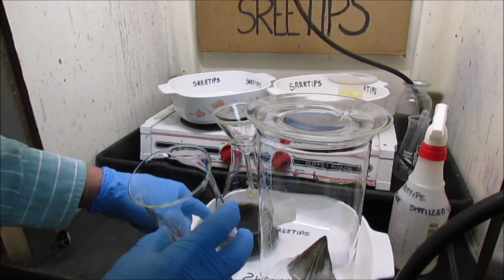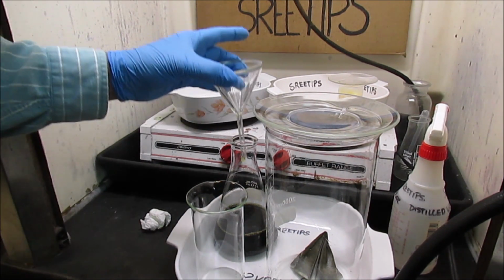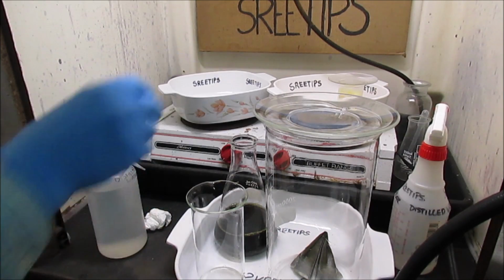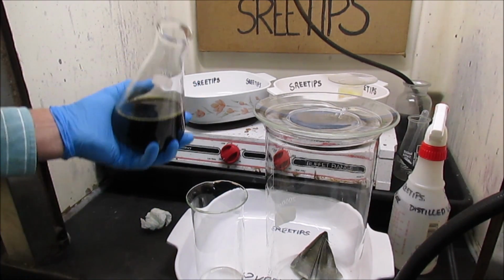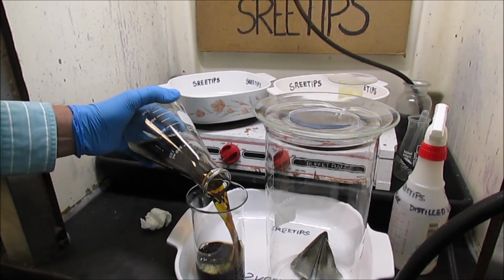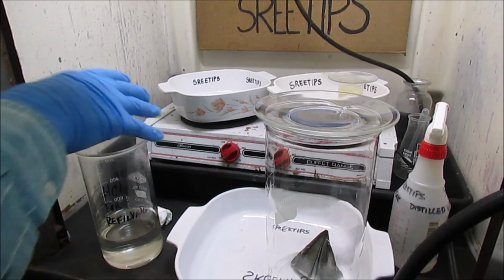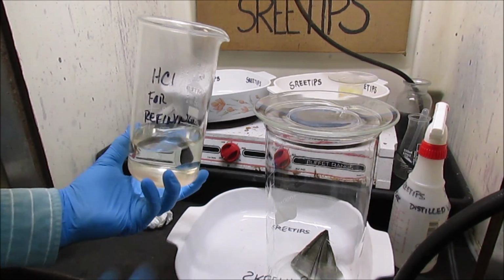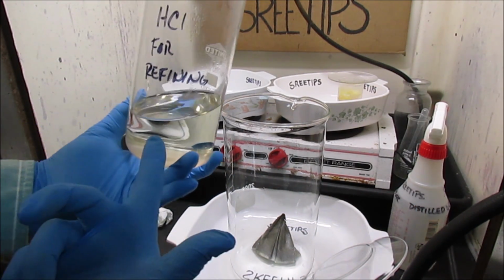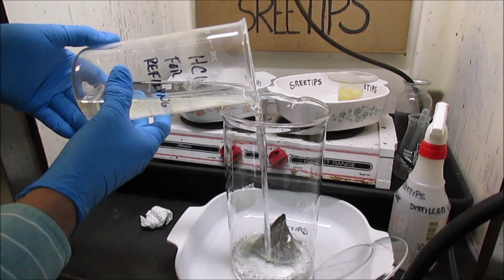For the solution here that came through the filter, I'm going to pour that into this tall beaker. I'd be tempted to add this to my main solution, and I might do that, but I won't do it until it settles out completely. Alright, I'll set this solution off to the side here. This is some hydrochloric acid that I had some pure gold rinsing in, and I'm going to use it for refining this material that's in this filter.